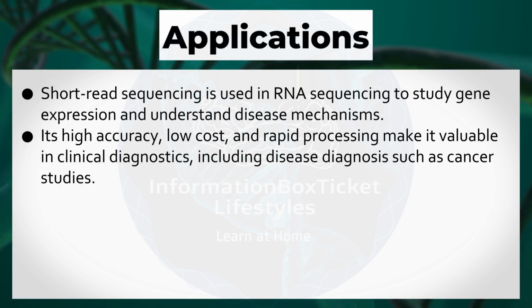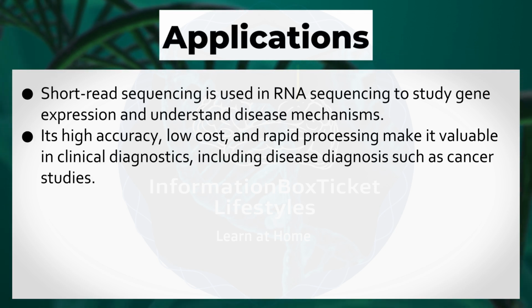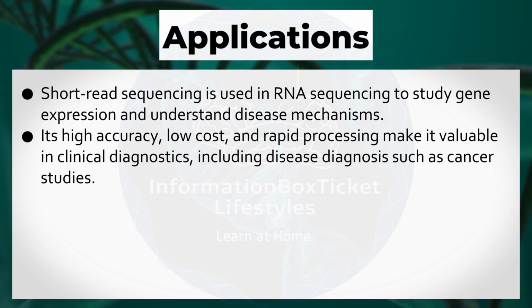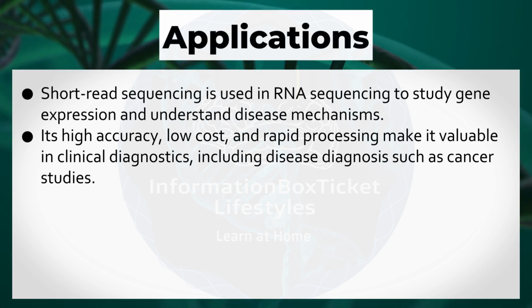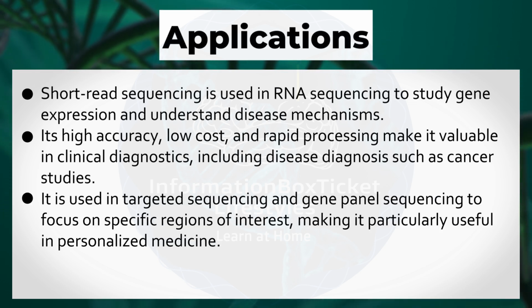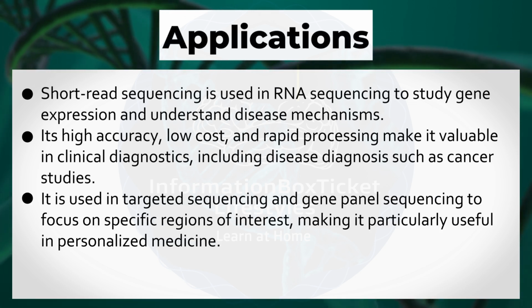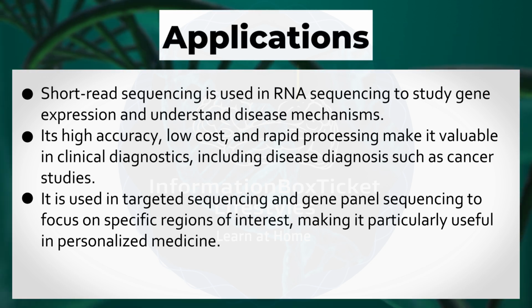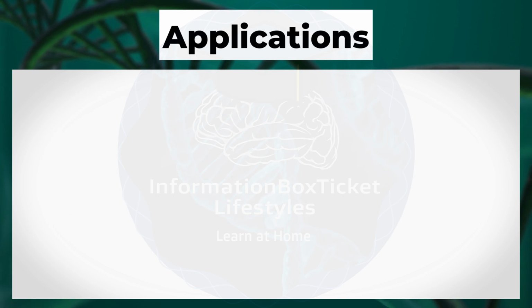Its high accuracy, low cost, and rapid processing make it valuable in clinical diagnostics, including disease diagnosis such as cancer studies. It is used in targeted sequencing and gene panel sequencing to focus on specific regions of interest, making it particularly useful in personalized medicine.